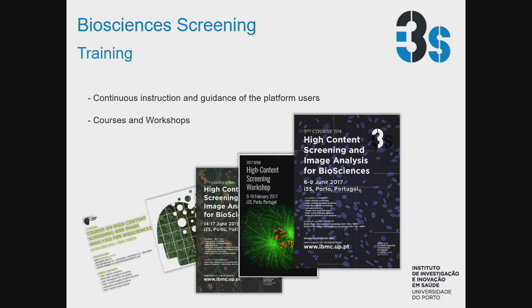We provide training by continuous instruction and guidance of our platform users, but we also regularly organize courses and workshops with the thematic of high throughput and high content screening, as is an example of the high content screening and image analysis for biosciences. And as Maria introduced in her presentation of the platform, we merged this course into high throughput and image analysis for bioscience, which will be run in June next year.